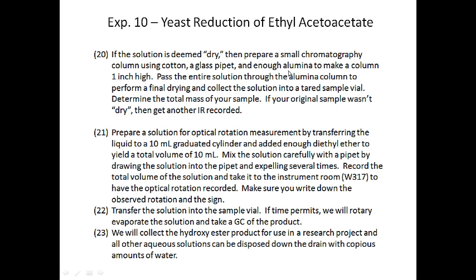You may have to put the solution into that pipette and use the amber bulb to push that solution through the alumina.